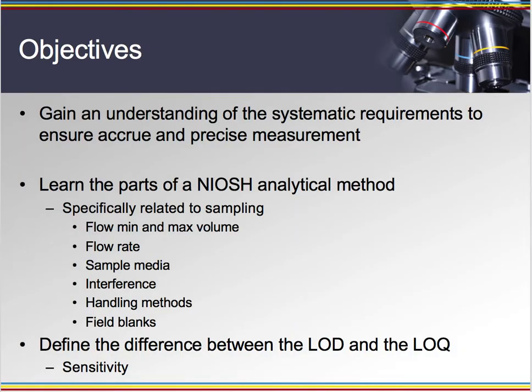So the goal of this learning unit is to gain an understanding of NIOSH methods, or the systematic requirements that will ensure that the data that you collect is accurate and precise. Although there are different methods from the EPA and OSHA and different sources, I'm going to stick specifically with NIOSH analytical methods, just because they're widely used and simple, I believe, to interpret.